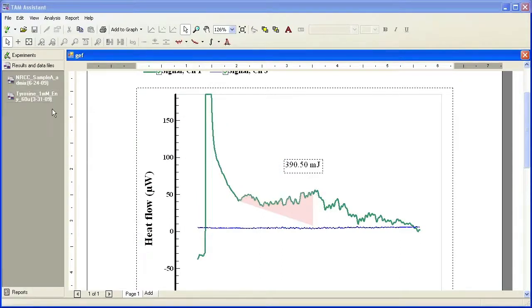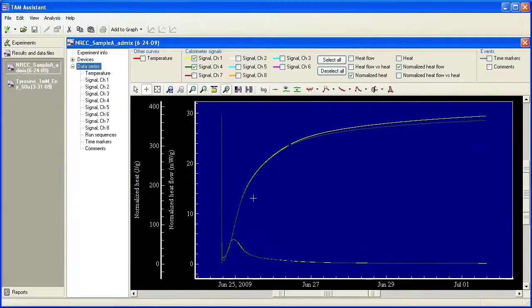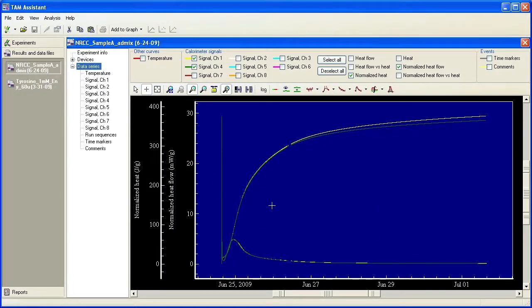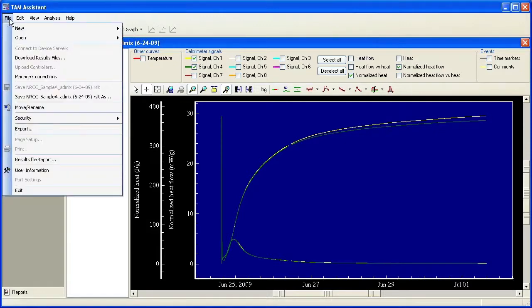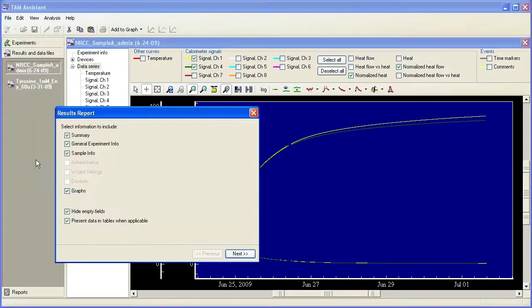There's another way that you can create a report, and I'm going to use this cement sample as an example. So once you have the results open, you can come up here to file and say results file report, and you'll be prompted to select what you would like to include in your report.